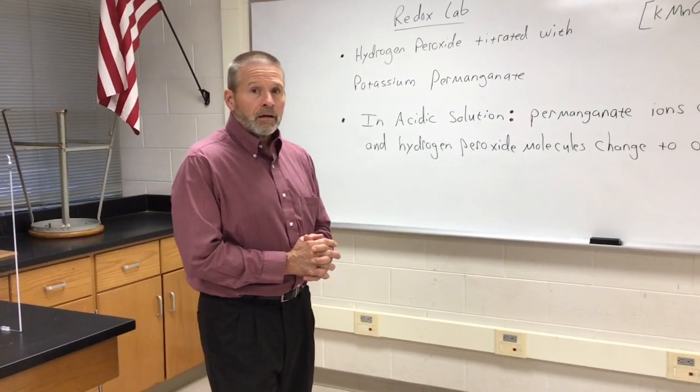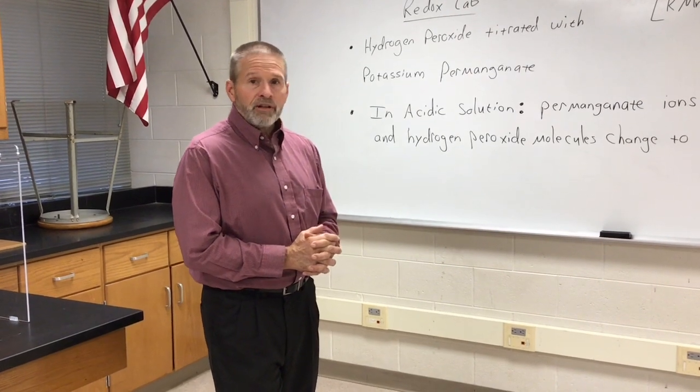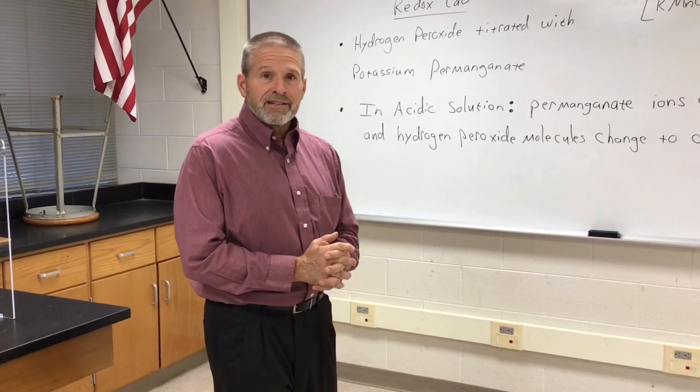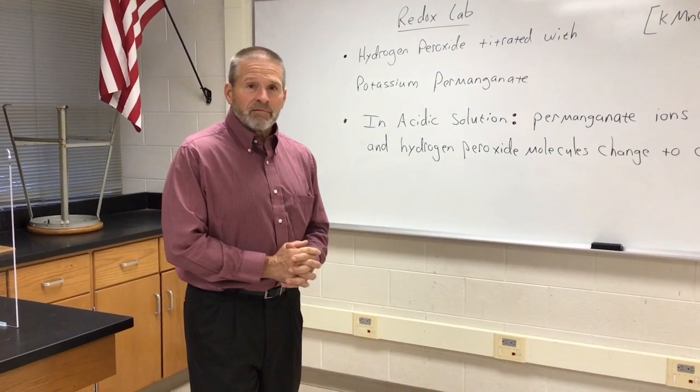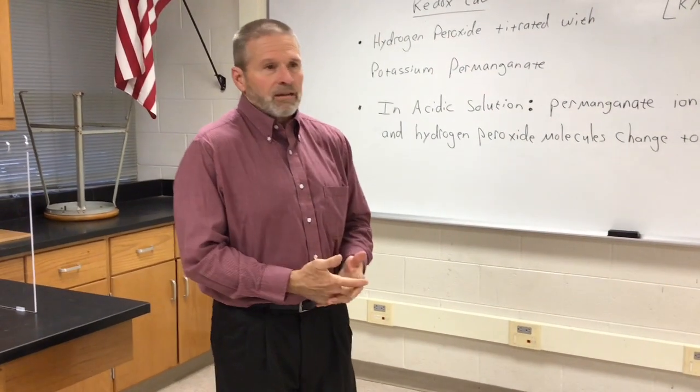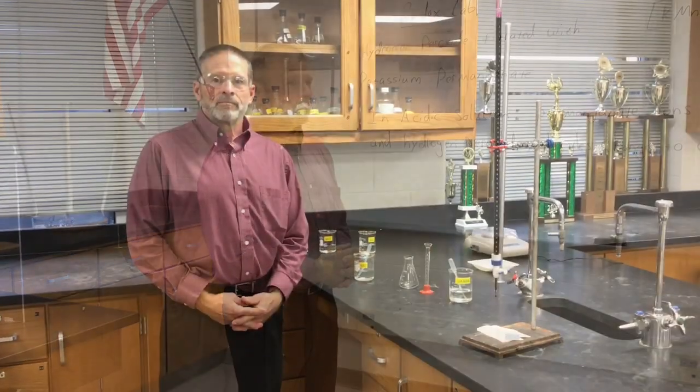Will we have to balance the net ionic equation too? I think you need a balanced net ionic equation. Did I not say that, Mr. Moore? Probably not. Or don't balance it. It's fine. Doesn't matter. Doesn't it? Yeah, okay, whatever.